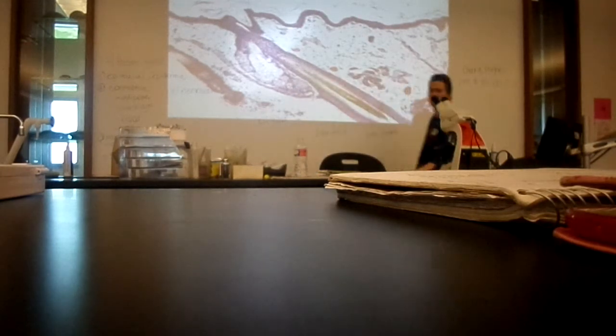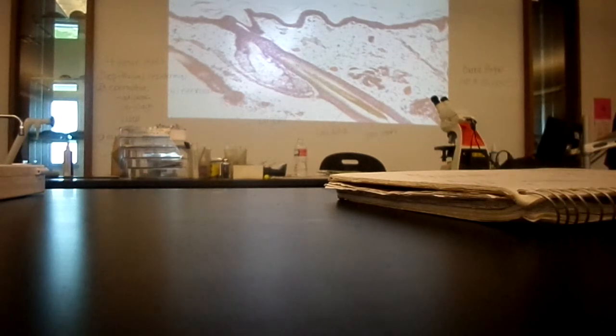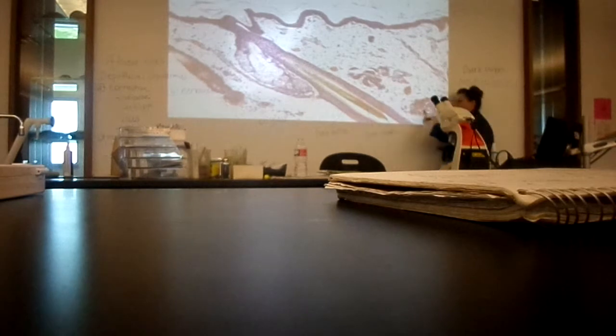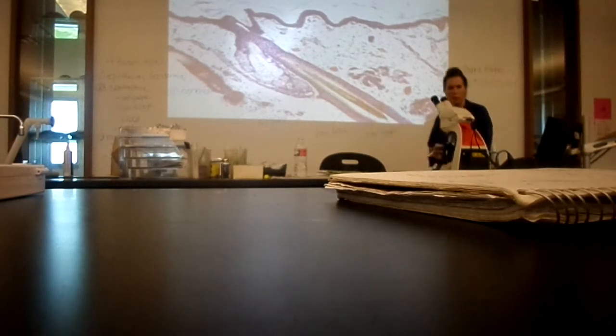Oil gland. Okay? If I ask you about an oil gland on the test, it will be associated with a hair follicle, so you'll be able to see it next to that hair follicle. This gland here, this one here, and there's a smaller one here.